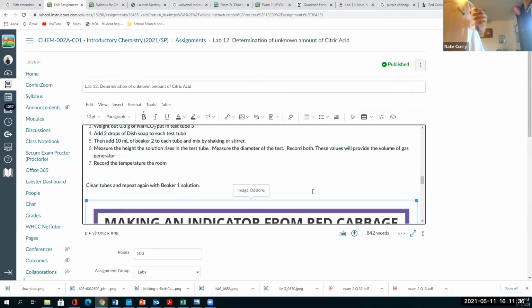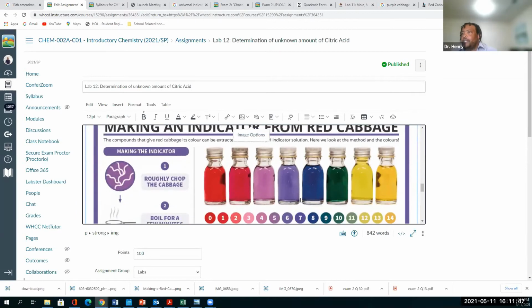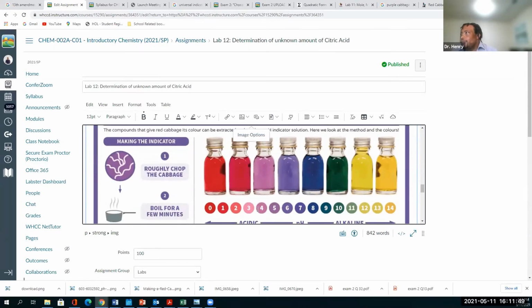Dr. Henry, the vinegar still stayed that same really purple color. It's a pretty color, but it's not a changing color. Okay, so we're not getting any change. So it's still around 4. 4-ish. Yeah. Oh, it's like blue. All right, baking soda made it turn blue, like 8.